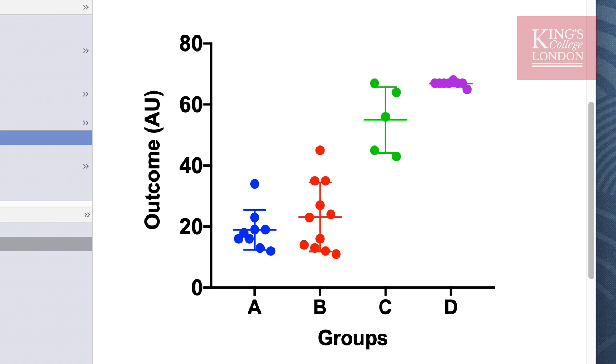Group D however has a very narrow distribution of data, very small error bars, and I would be concerned looking at these data whether they might be normally distributed. However, before testing for normality we're going to ask a few questions of these data and ask Prism to summarize these data in the form of descriptive statistics.